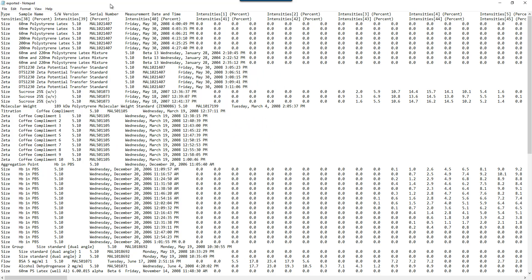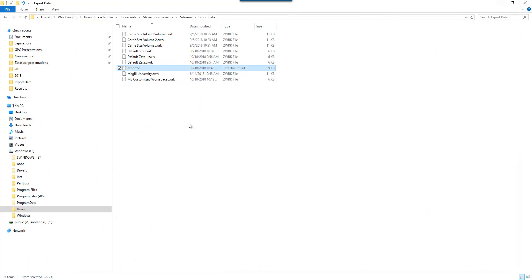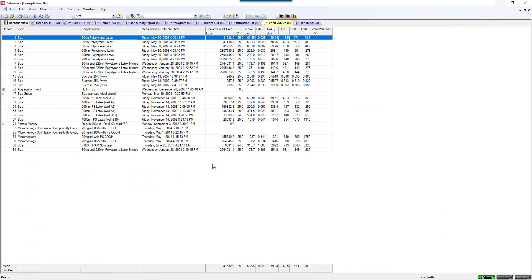You see all of my file has been exported. This is just to a notepad document or a text document, but you can also open this in Excel as well and see those occurring.